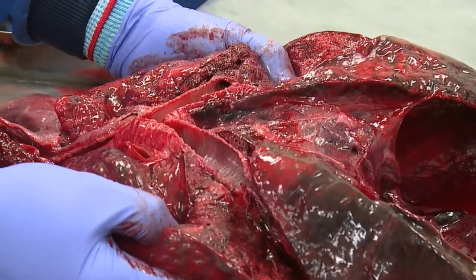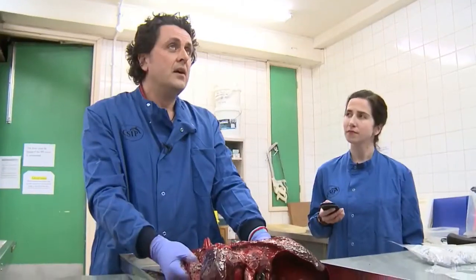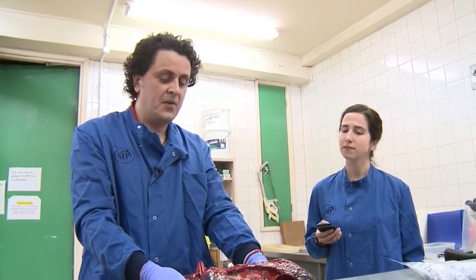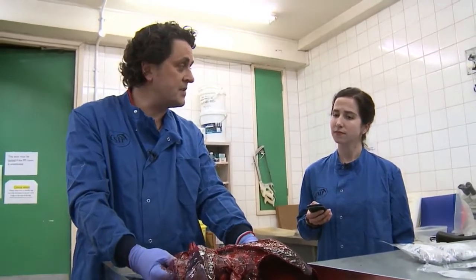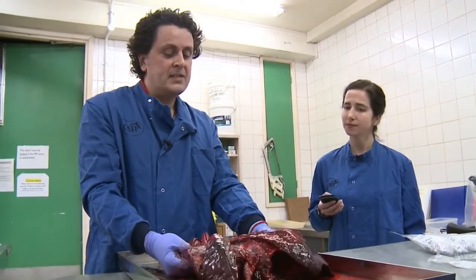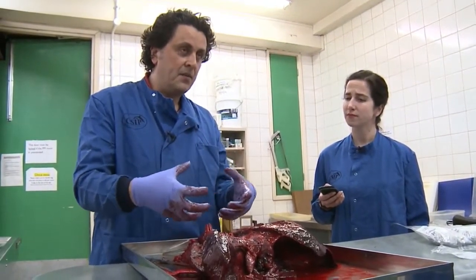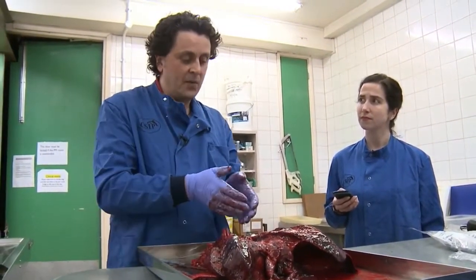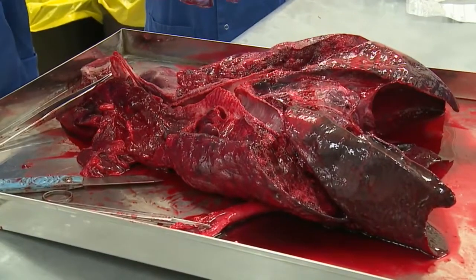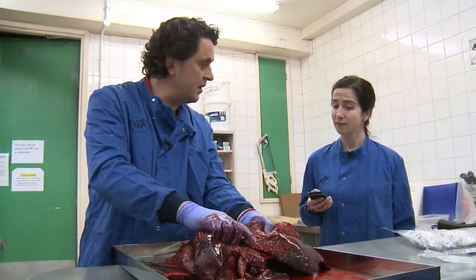Cetaceans have a different autonomic response to humans. When they lose consciousness underwater, they don't begin to inhale or aspirate seawater. So paradoxically, in drowning cases in cetaceans, you hardly ever see water in the airways, always dry. This is actually more akin to suffocation. As they're beginning to go through the agonal process of death in the nets, the airways are working back and forth, and there's a mucus lining to the airways. As the walls touch each other, they whip up this persistent froth, which persists days, weeks after death.